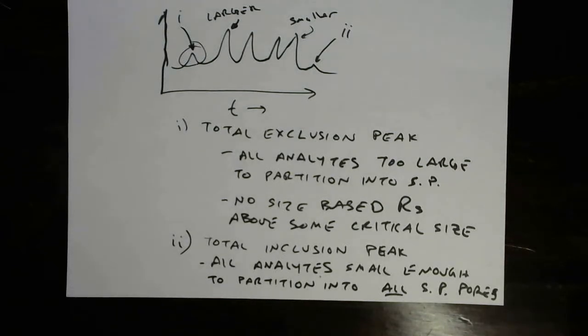Okay, so everything that's small enough to partition into all the stationary phase pores. So let's remind ourselves of the picture of what this partitioning process looks like.